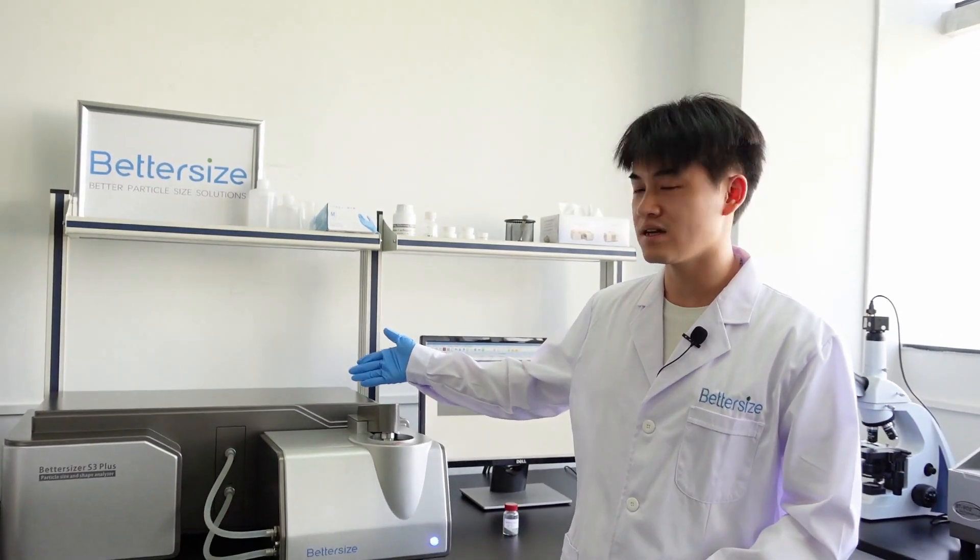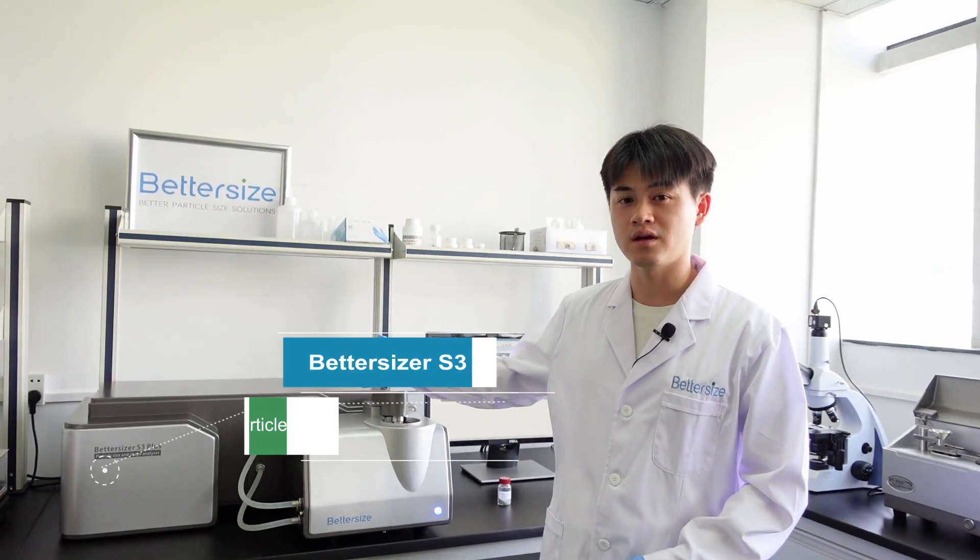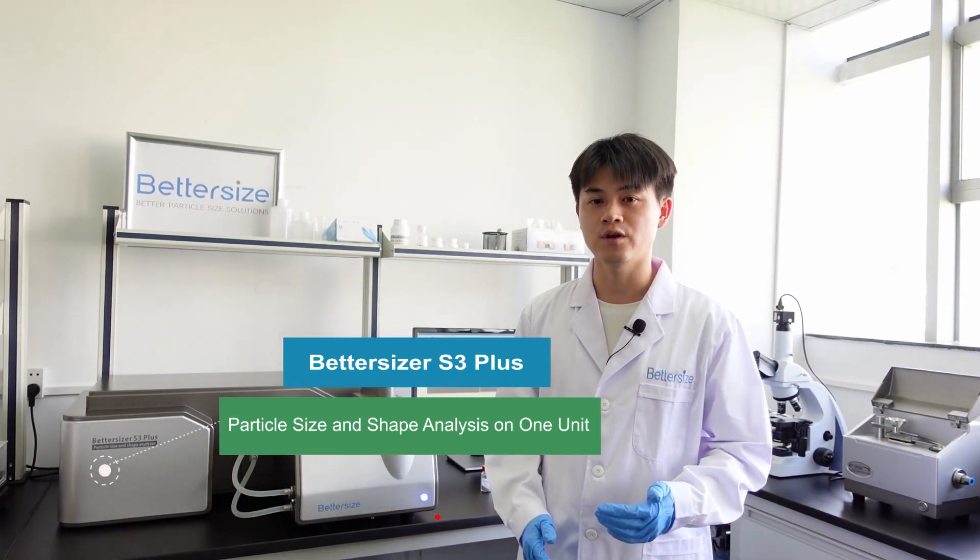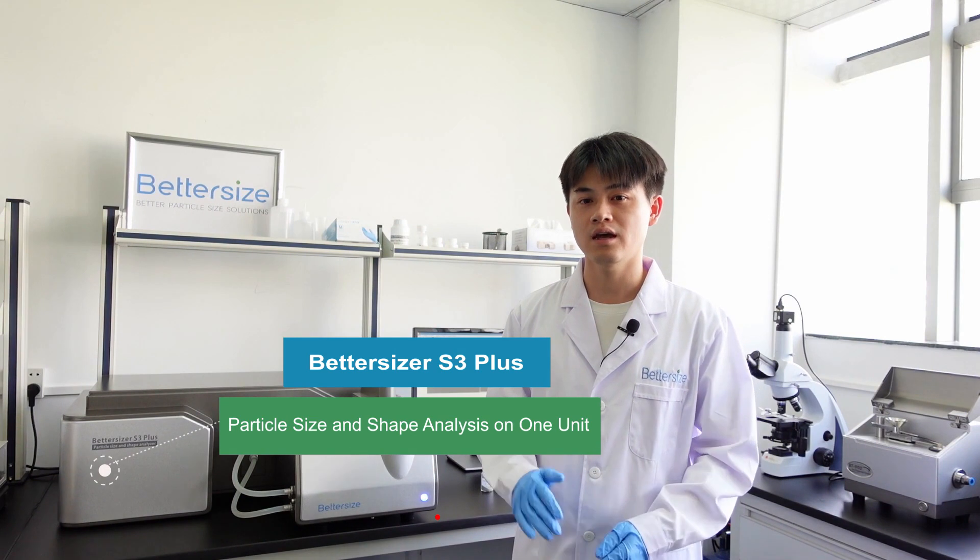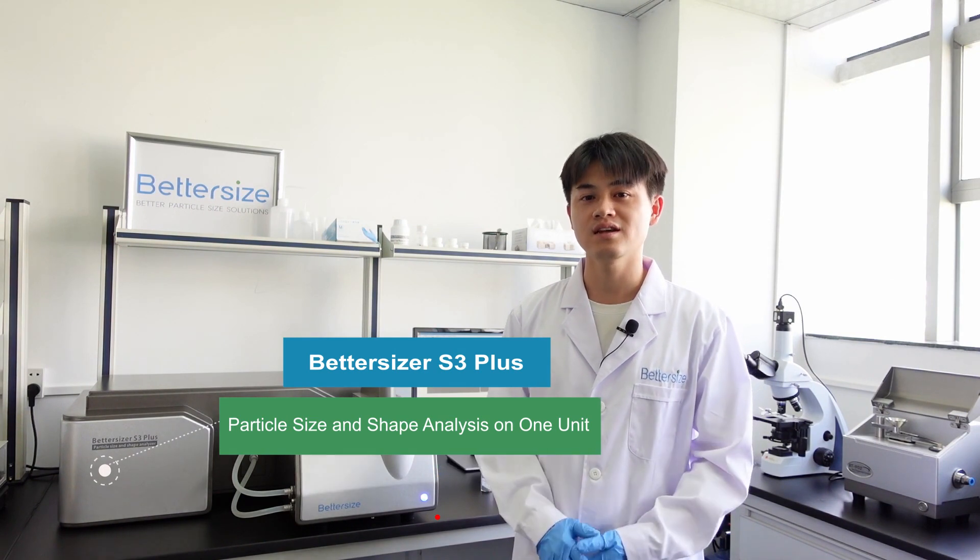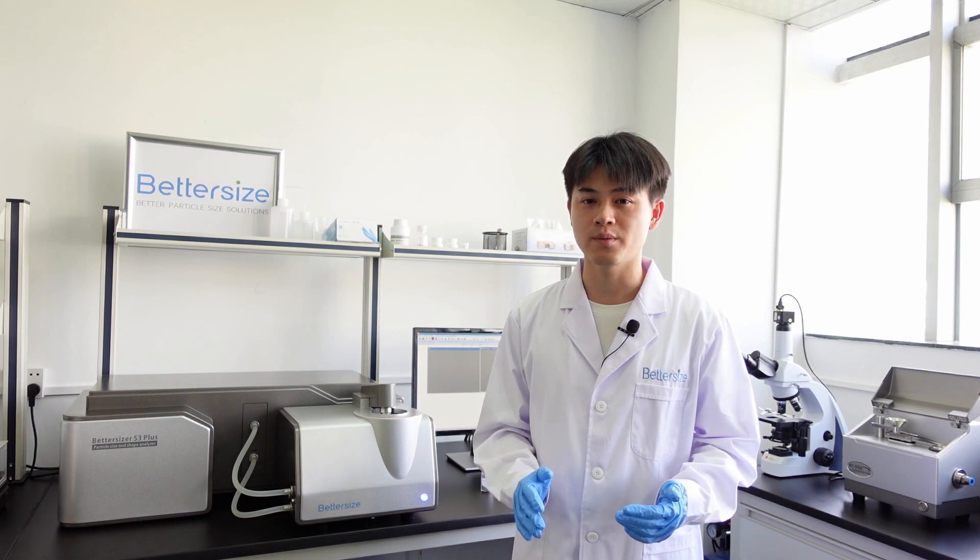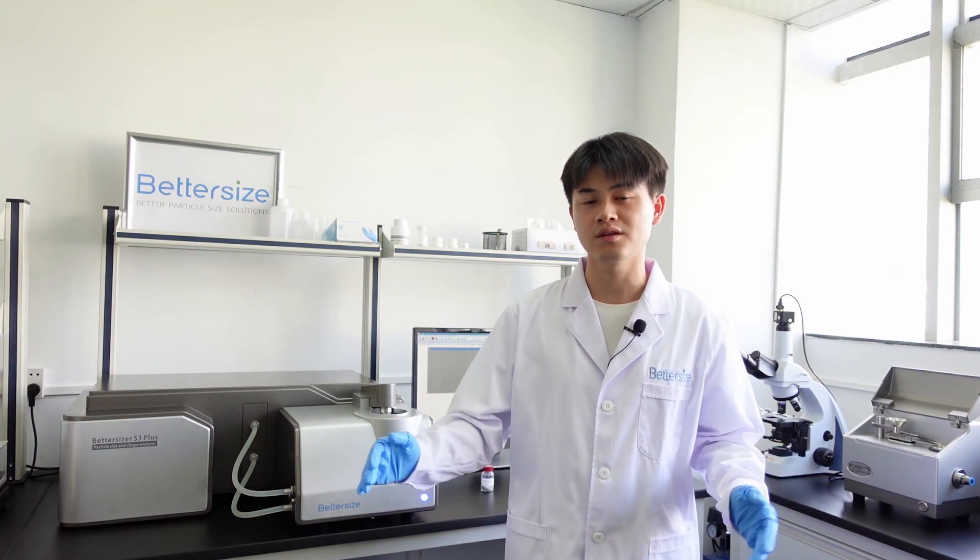Today I'm going to introduce the latest generation of particle size and shape analyzer, Bettersizer S3 Plus, which combines laser diffraction and dynamic image analysis. It offers unique and comprehensive particle size and shape characterization possibilities from the nanometer to millimeter range.